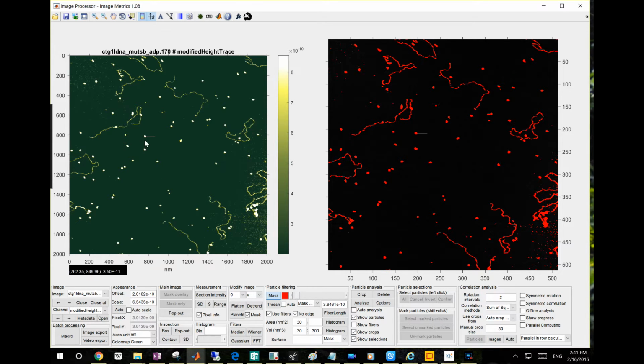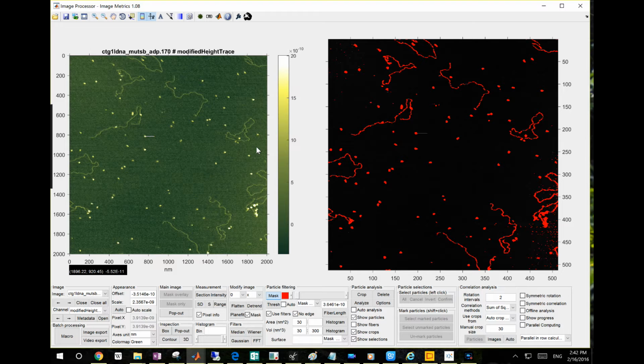So then let's go back to how to remove these artifacts here. To remove that artifact, let me do one thing first. I want to do the... it's not threshold, it's not scaled properly. Let's do the drag a scaling box. Distribution takes care of things. Yeah, I want to remove that specific spot which has a true line there.